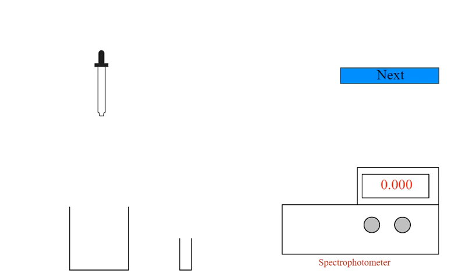This is a follow-up question from our lab that we did with a spectrophotometry lab for limiting reactant stoichiometry. First thing we're going to do is put the copper solution into our beaker by clicking the next button. Then we're going to add the sodium hydroxide. Now we have sodium hydroxide mixed with the copper solution, and we got a faint blue left over, indicating that the copper solution is going to be a little bit left over here. There's not enough hydroxide to react with it all.